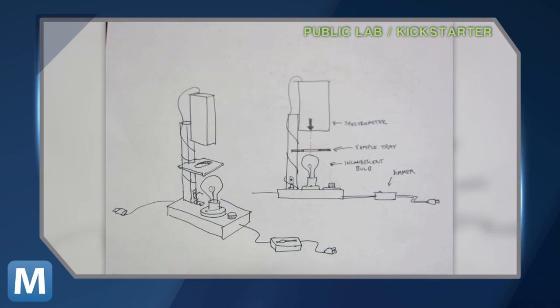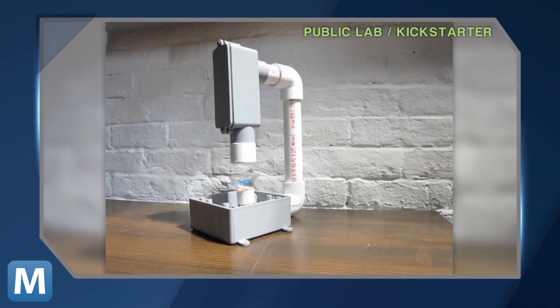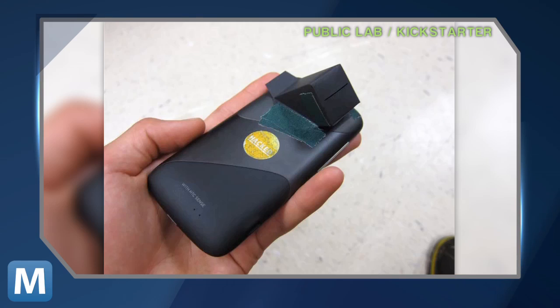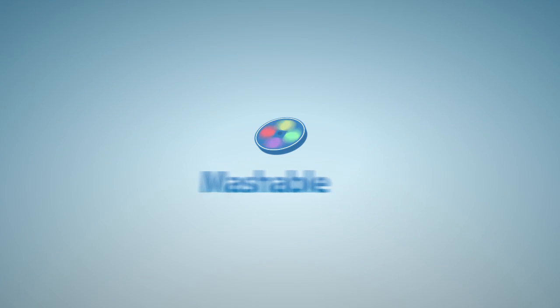The team has built several versions of the spectrometer, including a large countertop model for serious spectroscientists and a small fold-up spectrometer attachment for your Android. From Mashable, I'm Lauren Gores.